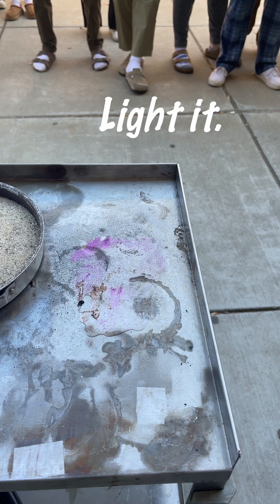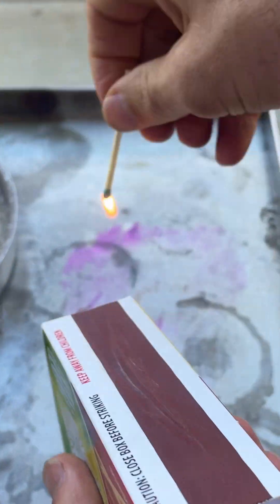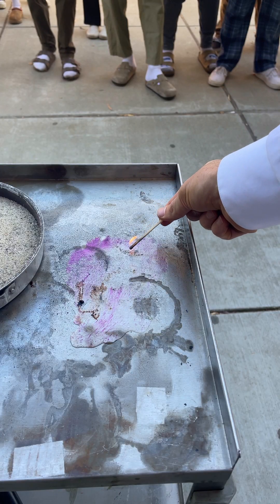Normally, if we want to light something on fire, what do you have to do? You need some heat. You need a heat source. Let's see if it lights.